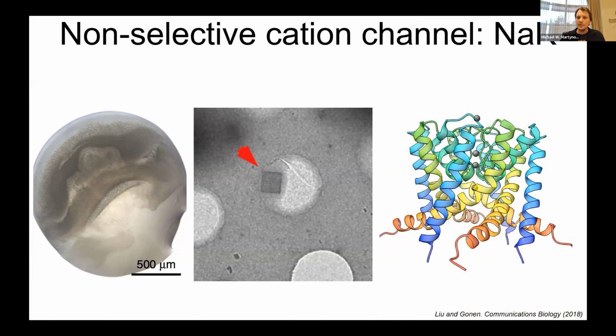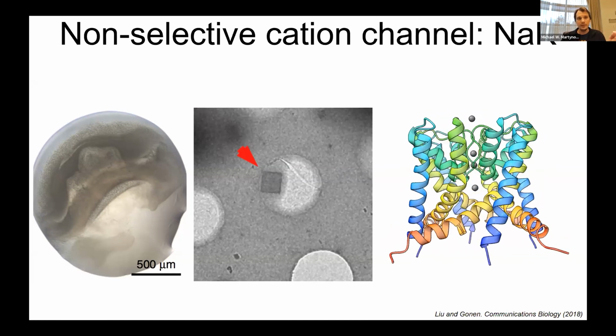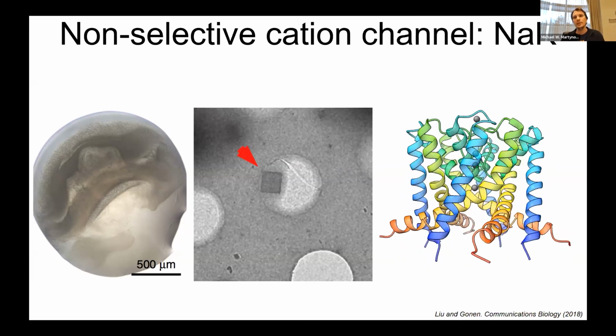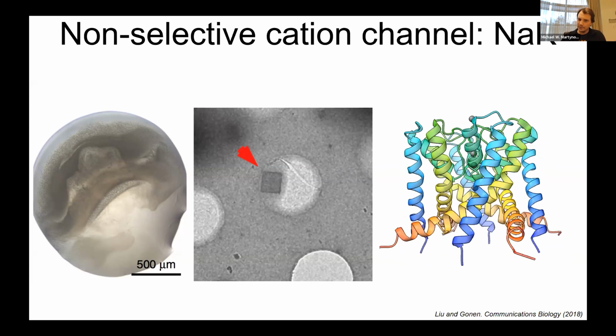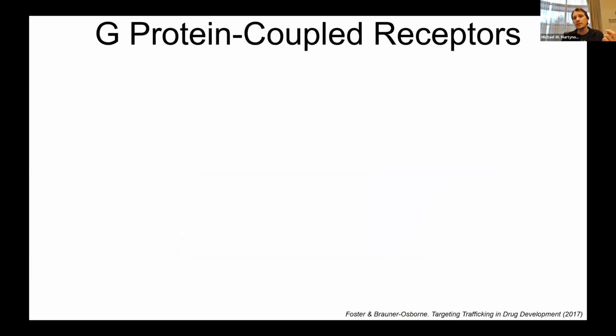So from here, we wanted to say, okay, now that we know it works for membrane proteins, let's see if we can do this for membrane proteins that are really important to human health. As a brief, very small introduction, these are called G protein coupled receptors. Something like half the drugs to 70% of the drugs, depending on which review you read or who you ask, are developed for these proteins. And they're very, very similar proteins in the human proteome. There are about 700 different ones.